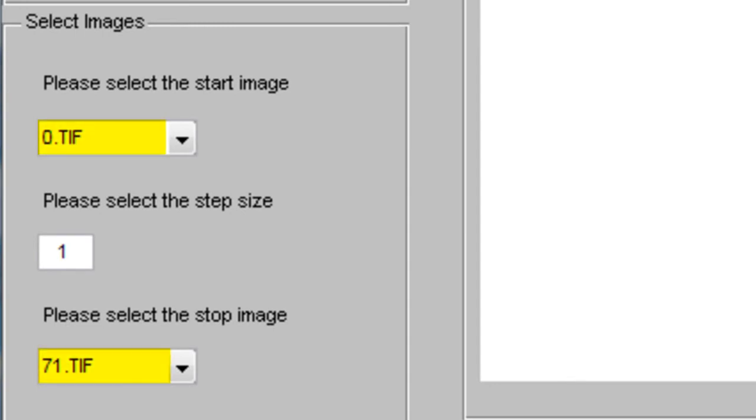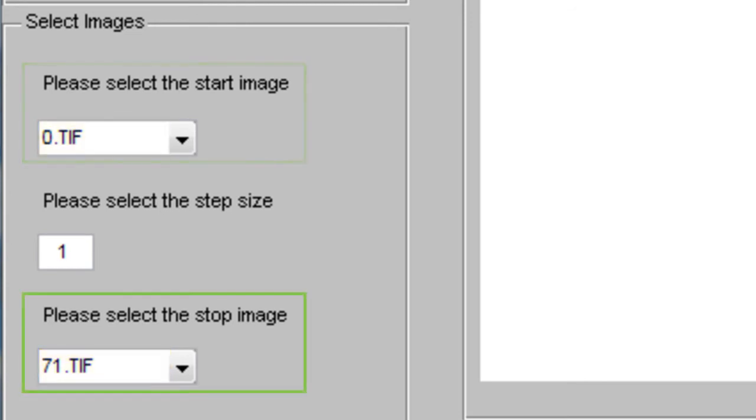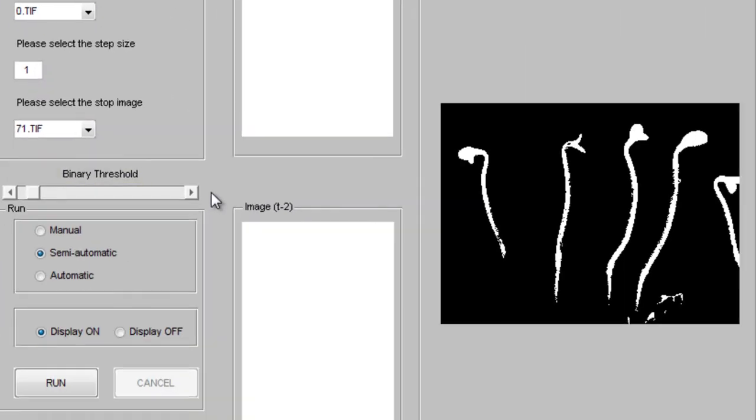It is important that you use TIFF files named in a numerical time series. Select your start image, stop image, and step size.